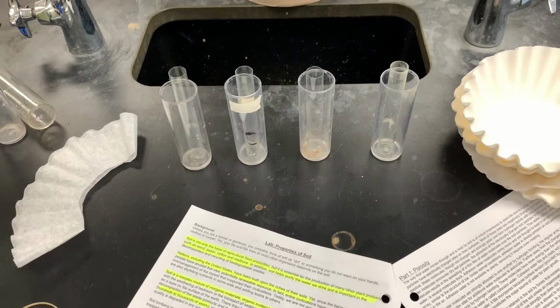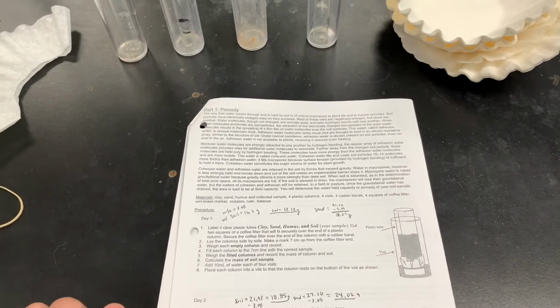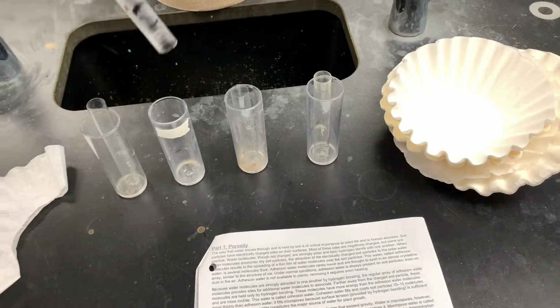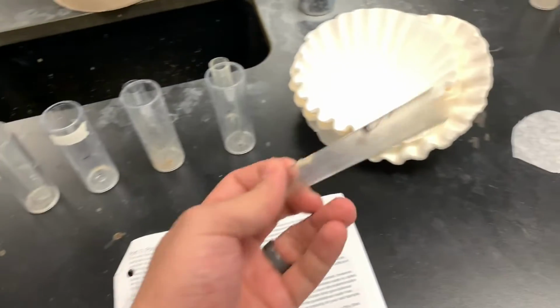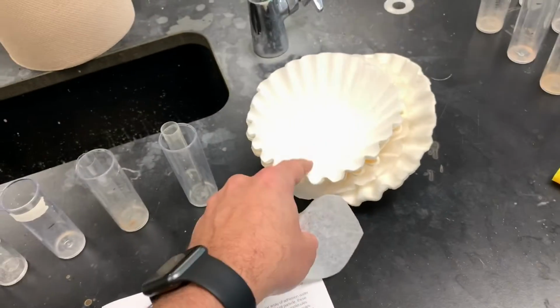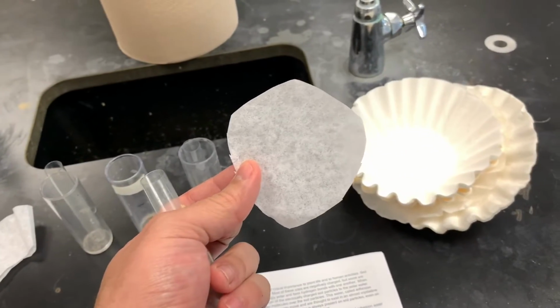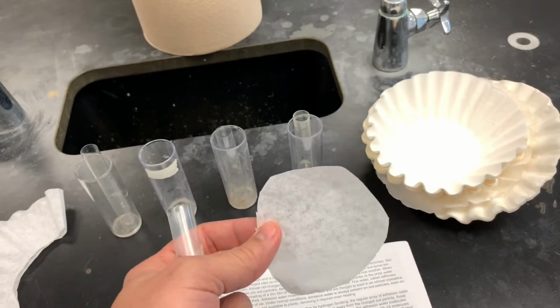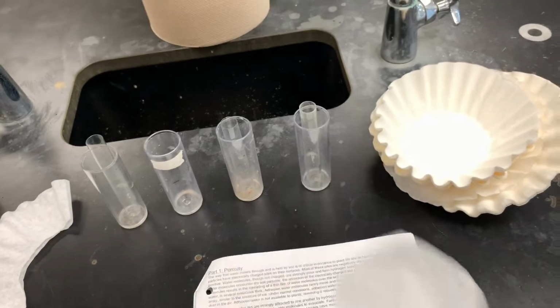So we're going to show how different soils absorb water differently in this first part called porosity. In porosity, basically what you want to do is get 4 tubes, call them vials. The first step is to take one coffee filter and cut out the circle that's in the center. Don't worry if it's not perfect. You're just going to cut off the circle that's in the center. And basically, you're going to wrap this around the end.